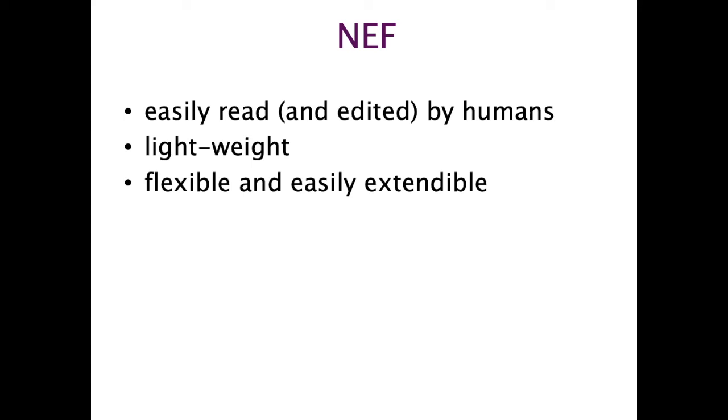As I say, programs can easily add their own save frames, but also within a single save frame they can easily add parameters that they want to provide. So if a program starts generating a particular value that it thinks would be useful for other programs to know about, it can just add that in, and any other program that wants to harvest that can do so, but if they don't know about it, again, they won't fall over, they just ignore it.